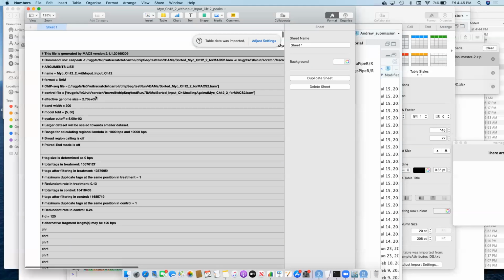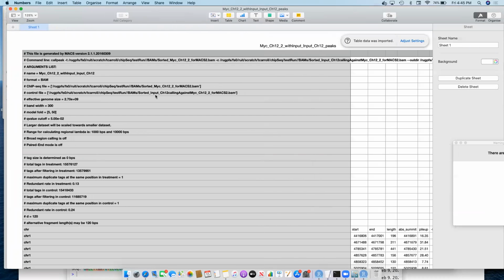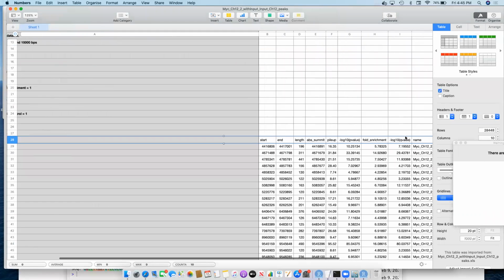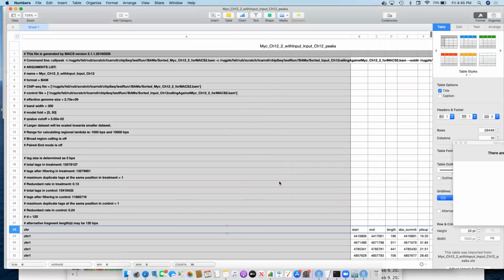Okay. If we look at this file, we can also see some of the reasons we really want to take care of comments. So you can see here, all these lines are commented by having this hash at the beginning of them. And actually the real data starts post comments where we have chromosome 1, start, end, something which looks a lot more like a BED file or something we can turn into a GRanges.